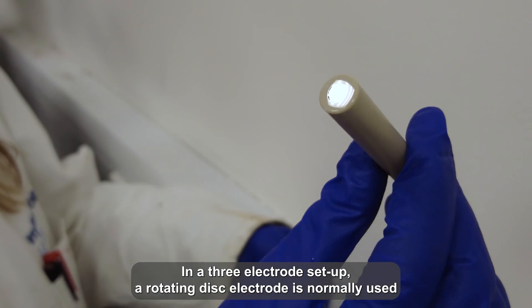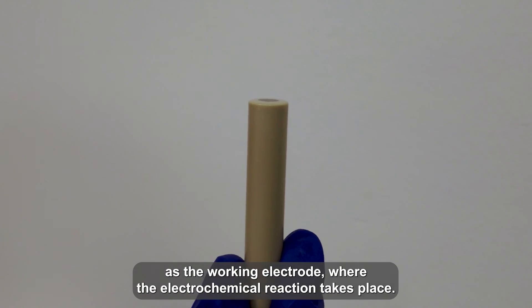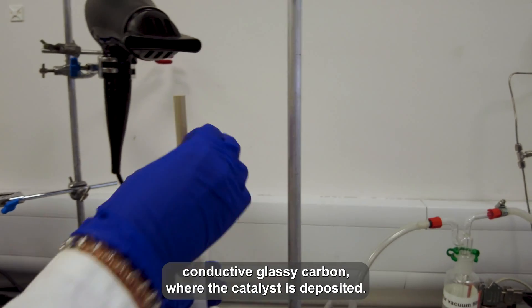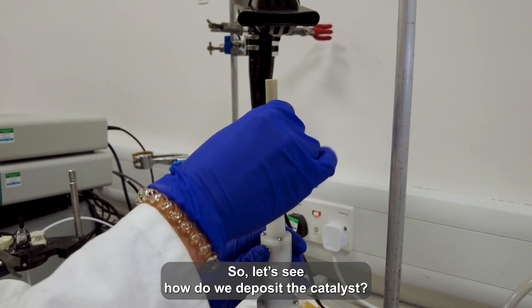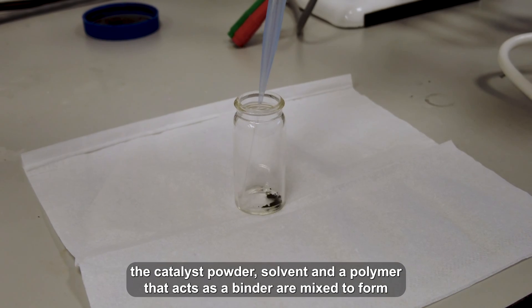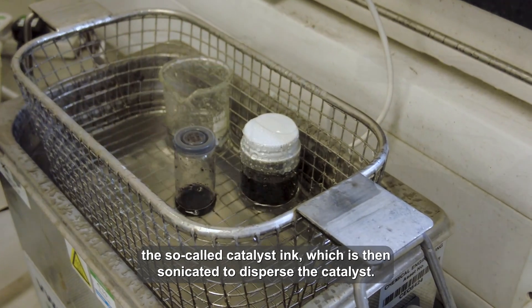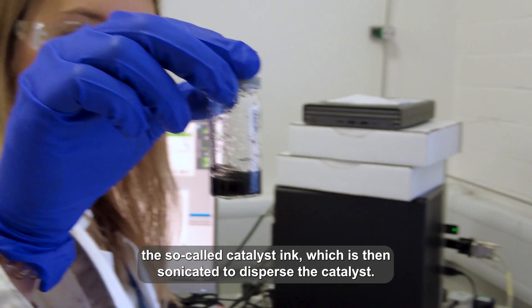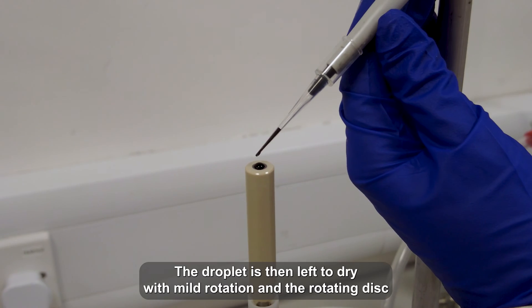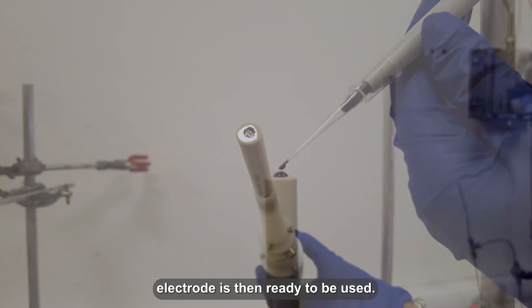In a three electrode setup, a rotating disc electrode is normally used as a working electrode, where the electrochemical reaction takes place. The rotating disc electrode is usually made of conductive glassy carbon, where the catalyst is deposited. The catalyst powder, solvent, and a polymer that acts as a binder are mixed to form the so-called catalyst ink. This is then sonicated to disperse the catalyst, drop-casted with a pipette on the electrode, left to dry with mild rotation, and the rotating disc electrode is then ready to be used.